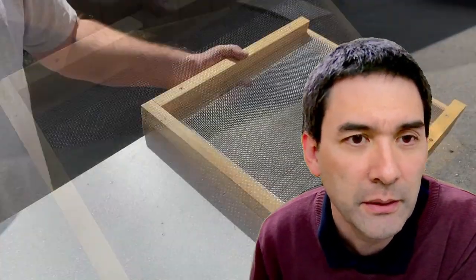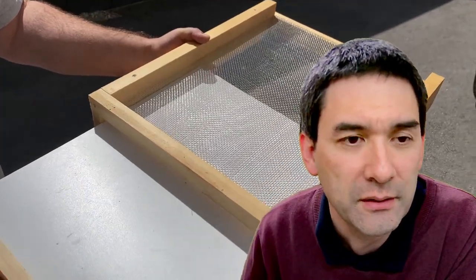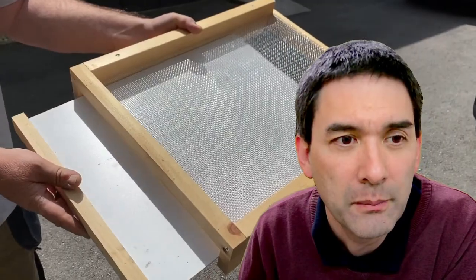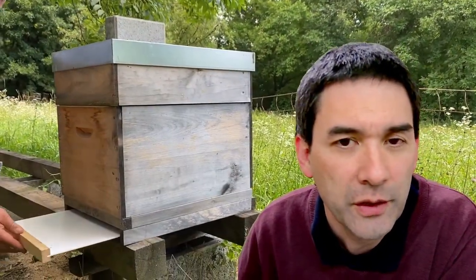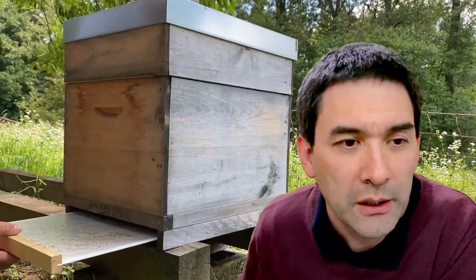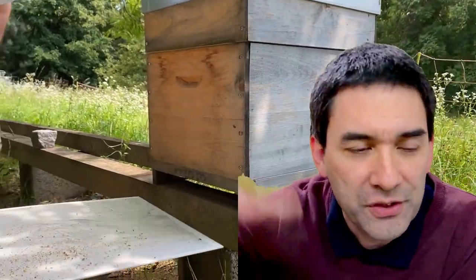So this is some kind of a mesh here, and they put this white board on it, and there is some paper and some sticky foil on it. And you see over here, they put it into the beehive and then they leave it in there for a day or so. And then stuff falls down, including the mites. And this is where you get this from.